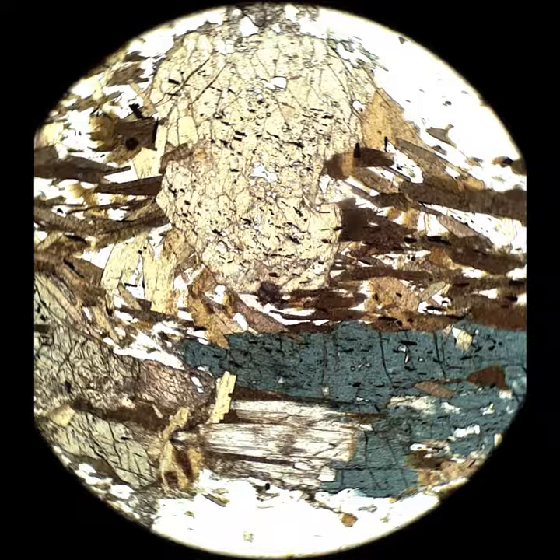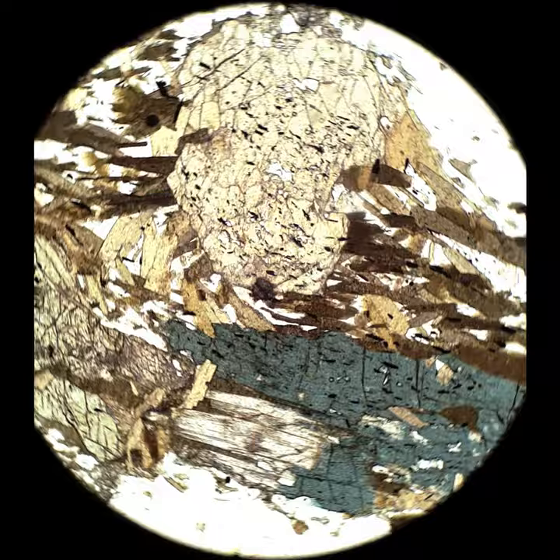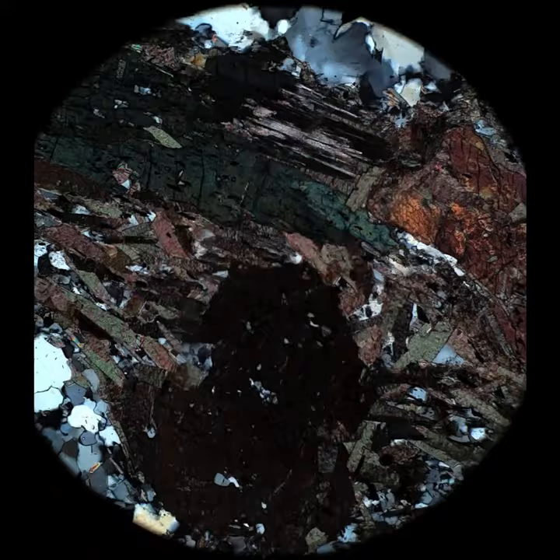I put this in here to show some of the different colors that hornblend can have in plain polarized light, dark green to sort of yellowish to bluish green. When I cross the polars, you'll see the elongated grain has inclined extinction.